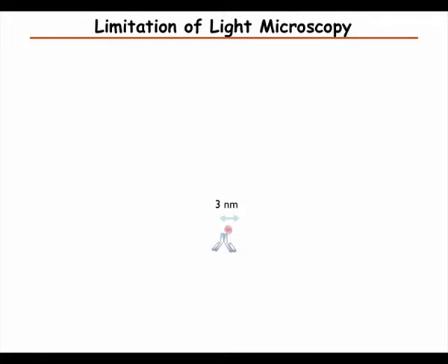Now I'm going to move on to microscopy. So far we talked about how with mass spectrometry we can identify interaction partners. But we really also want to go a step further and see the details of these interactions. Microscopy is, of course, very powerful at giving us the spatial resolution, localization, and so on.